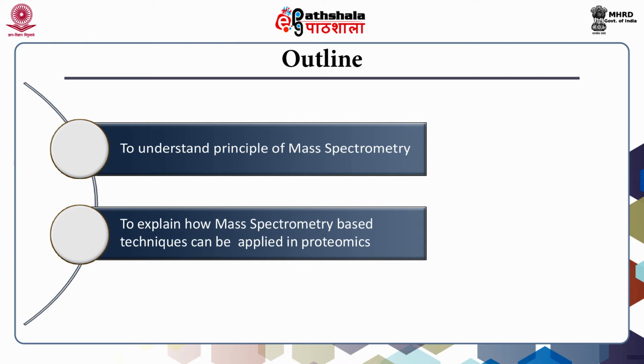In clinical proteomics, identifying various biomarkers for various physiological and biological processes has been a recent trend, where individual biomolecules can be identified and subsequently used for diagnosis of various diseases and various biological disorders. As such, we can identify a complex of proteins which can be further analyzed by using various bioinformatics software.